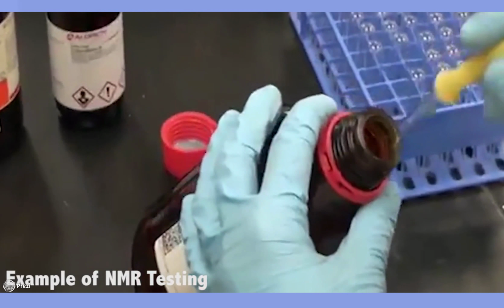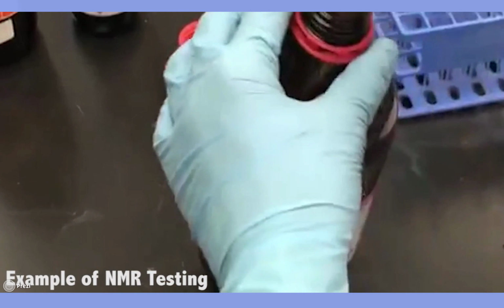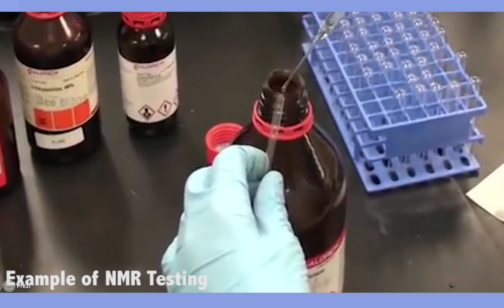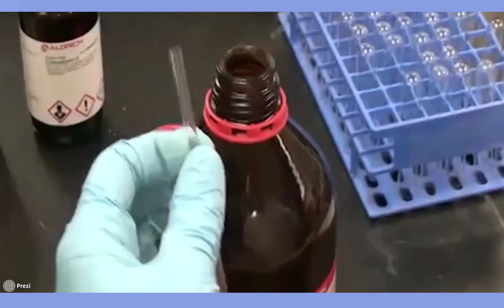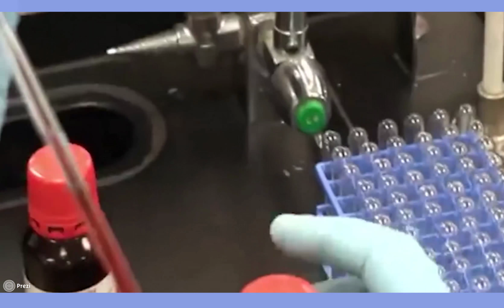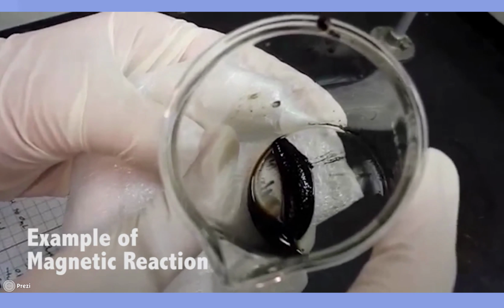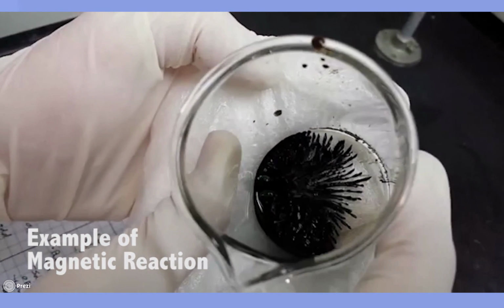The variation for the 0.8 ratio was that we added 5 milliliters of 2 molar iron chloride to the jar instead of 2.5 milliliters, and the synthesis was then adding the normal 25 milliliters of ammonia, NH3, and that was when the nanoparticles started forming. After creating the nanoparticles, we could see they had magnetic properties. When taking the magnet to the jar, we could move the nanoparticles around the jar wherever we made the magnet move.